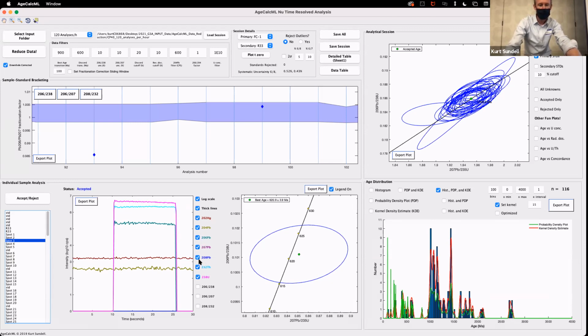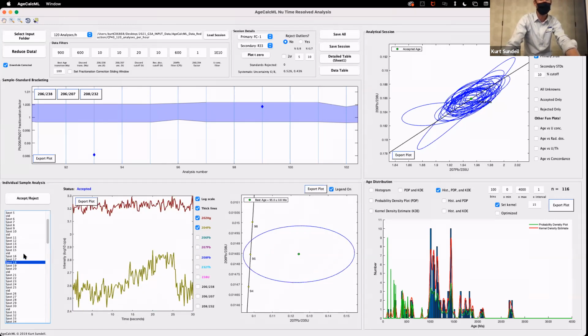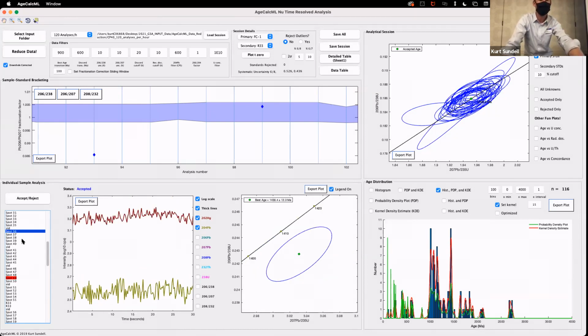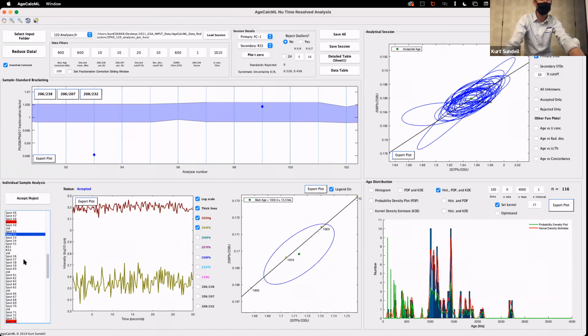So all of this is interactive, right? You can turn on and off different elements, say you only wanted to look at your mercury concentration for whatever reason. Maybe you suspect there's some contamination issue. You can click through your samples and see, are these normal values that I would typically see coming out of my helium, which oftentimes can contain some mercury. And so here we see the session was generally running pretty good that day.